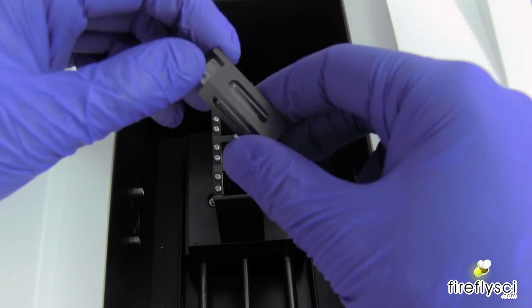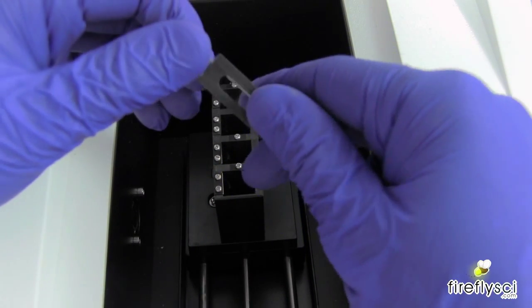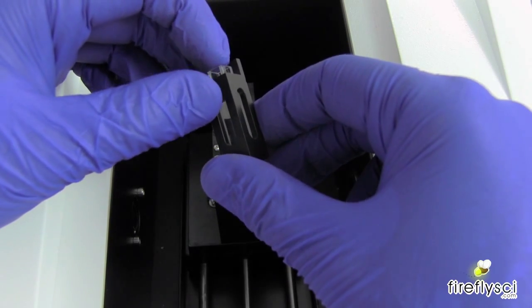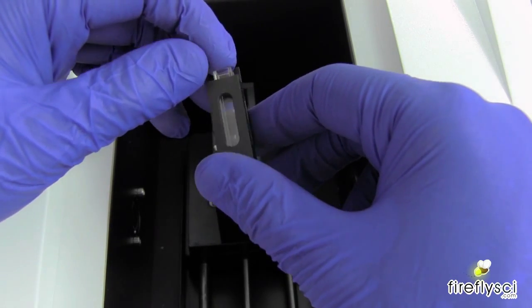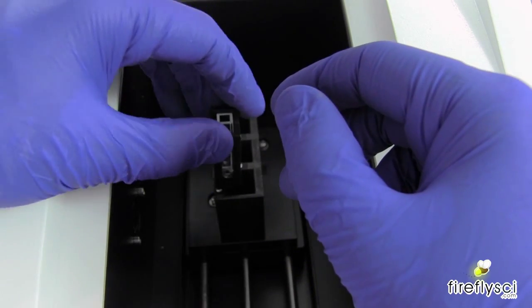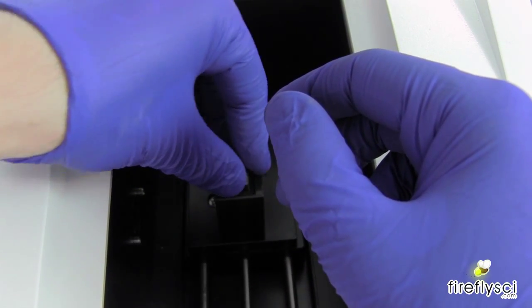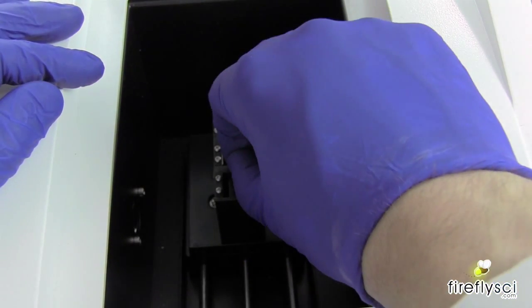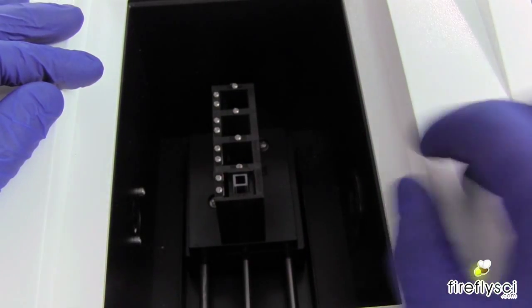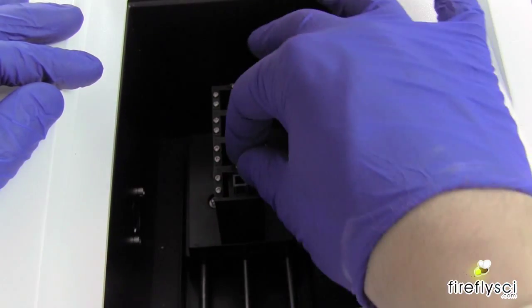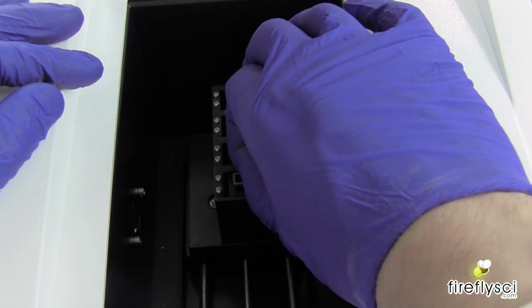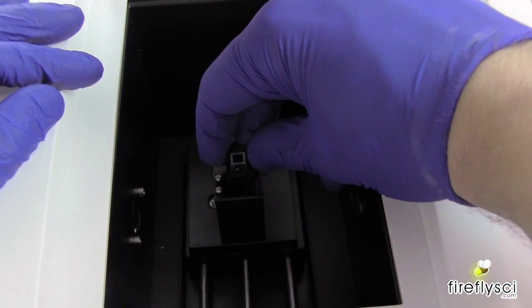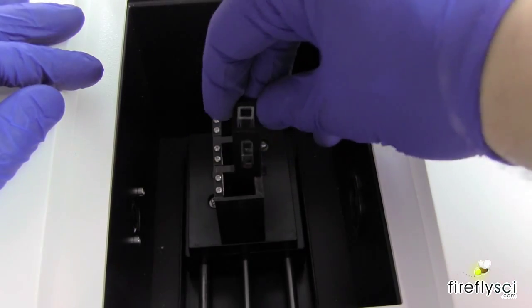Okay, so here we go. Now, since this has all four sides open, it really doesn't matter which way you put it into the spectrophotometer. This covers all Z dimensions of 8.5, 15, and 20 millimeters. So whichever direction you put it in is fine. So all you have to do is push it down, put it all the way down in. And what's nice, it has a little lip here so that even when you push it all the way down, you can still grab it because it has a little lip print on the end here. It's very easy to take back out.